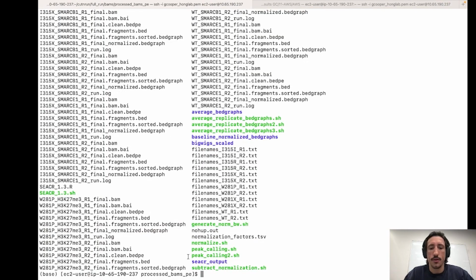Just a quick disclaimer, I realized I didn't show you how to actually run this command, so it's really straightforward. All you do to run this command and make sure it doesn't time out if it takes a while is type nohup, then period forward slash peak calling, and then add this ampersand. And when you hit enter, that will run the command in the background, and you will actually be able to see what files are being processed each time as it's running through the for loop. And so I just wanted to put that in there.